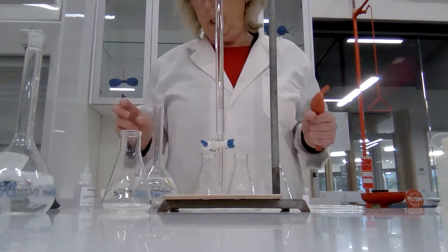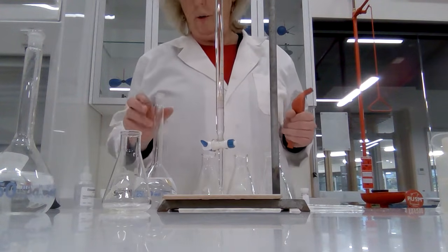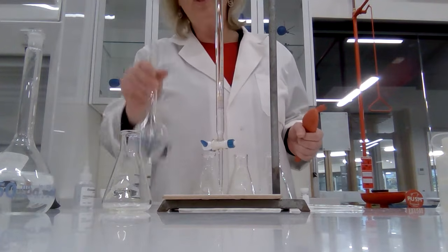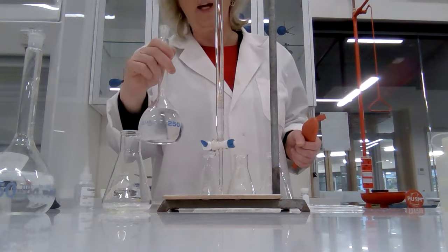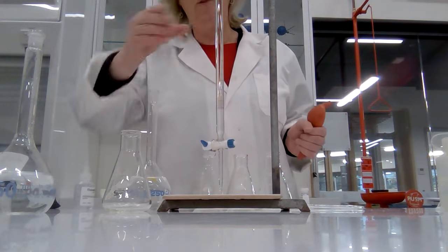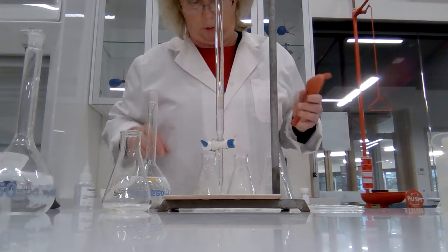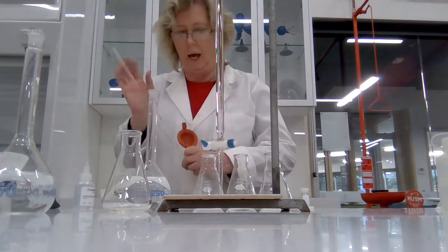We are going to do the titration of oxalic acid, which is here in this standard solution in a volumetric flask. We're titrating it with sodium hydroxide solution which is in the burette. I'm just going to add one more pipette full of oxalic acid to my third conical flask.